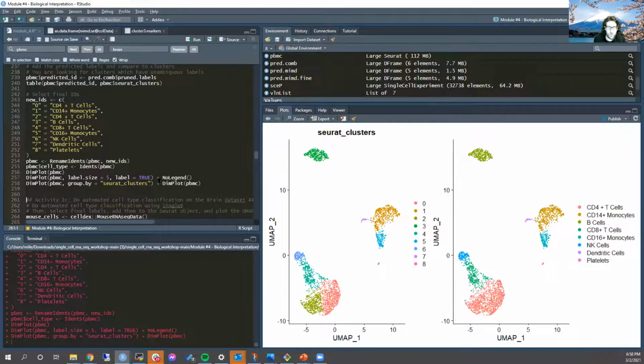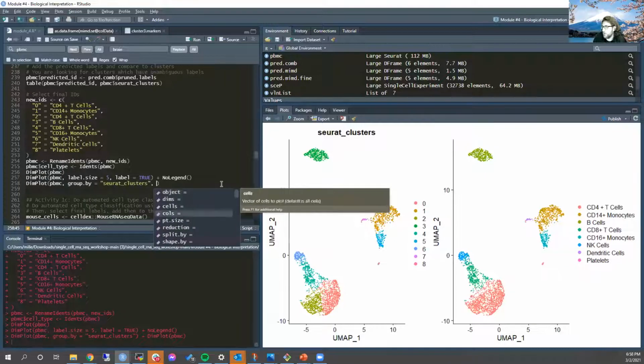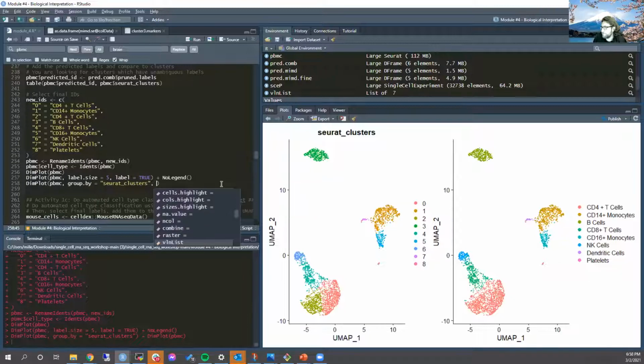How can we show only one subset using DimPlot? Are you talking about one subset of like the clusters, like one cluster? One cluster, yeah. Let's see here. So let's see. I know I haven't done this in a minute. So yeah, there's a couple ways you can do it. The first way, it's probably the easiest, is just to do split by clusters. But this might not produce the exact desired result you want.